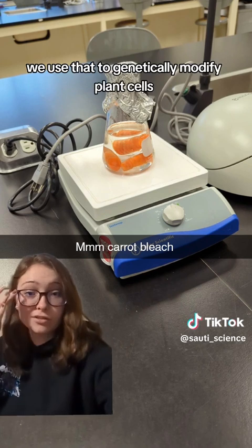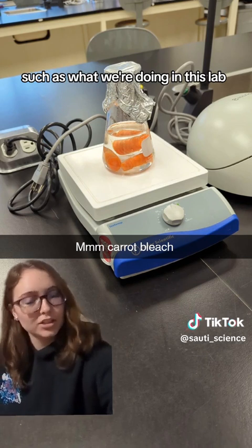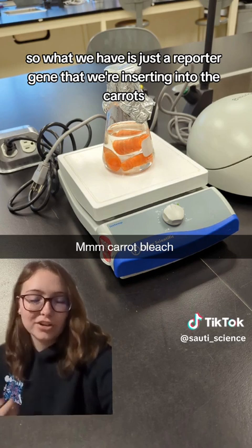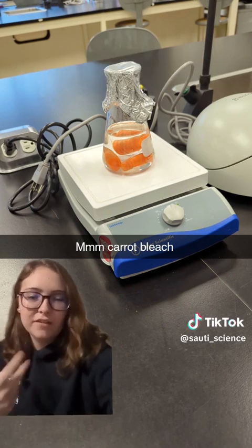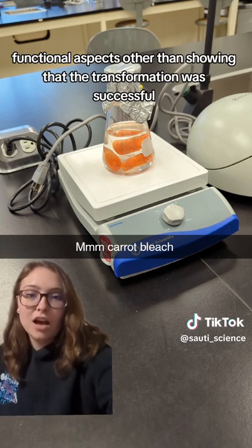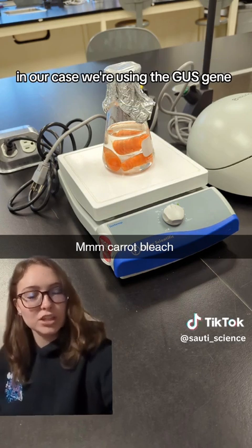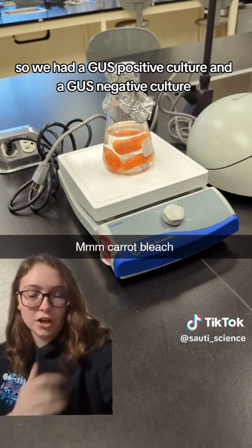We use that to genetically modify plant cells, which is what we're doing in this lab. We have a reporter gene that we're inserting into the carrots. A reporter gene doesn't really have any functional aspects other than showing that the transformation was successful. In our case we're using the GUS gene, so we had a GUS positive culture and a GUS negative culture.